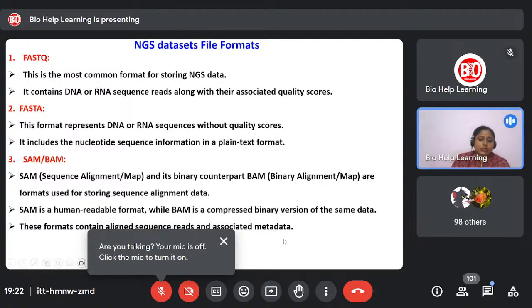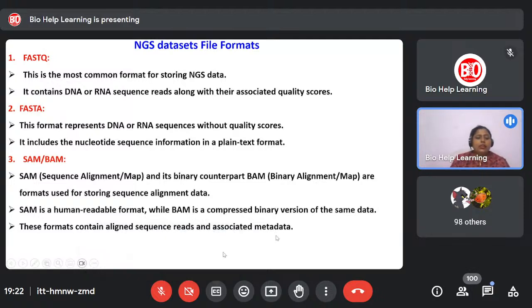So this is a new term you come to know. Here you have lots of data, but what is metadata? It means you have multiple NGS data, but among those data, you are getting more common data. Suppose you have 10 NGS data sets, and in these data sets you are getting 10 most common files. So those data are known as metadata. This term is called metadata.